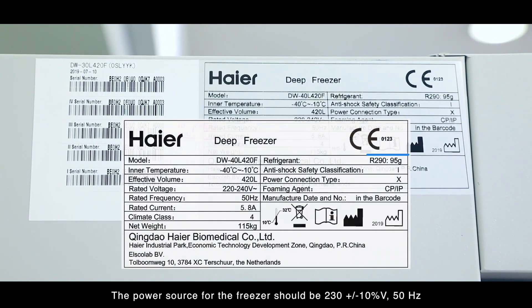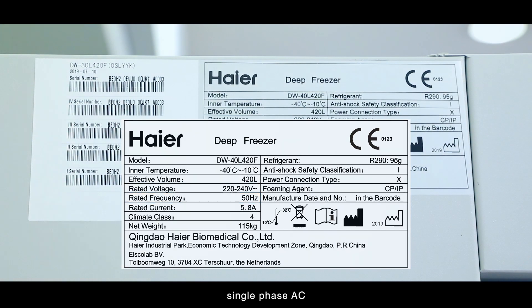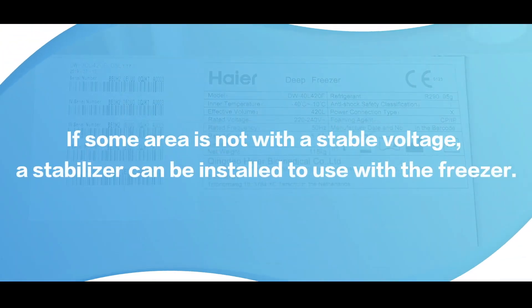The power source for the freezer should be 230 plus minus 10 percent volts, 50 hertz, single phase AC. If some area is not with a stable voltage, a stabilizer can be installed to use with the freezer.